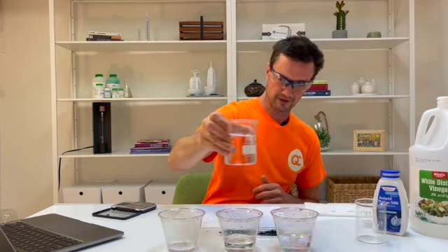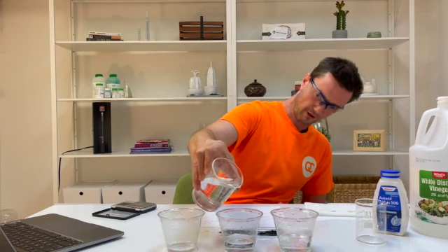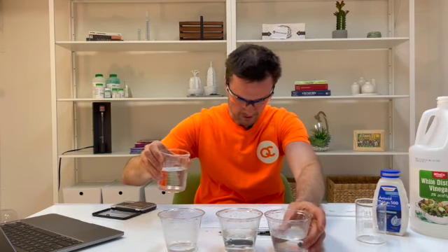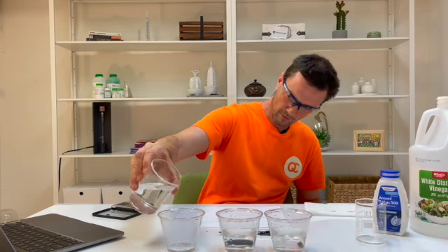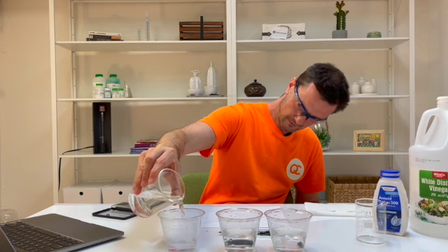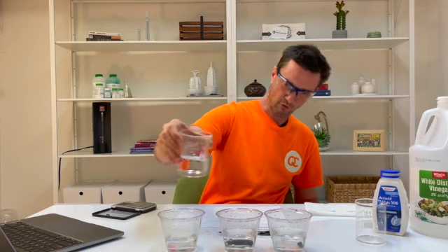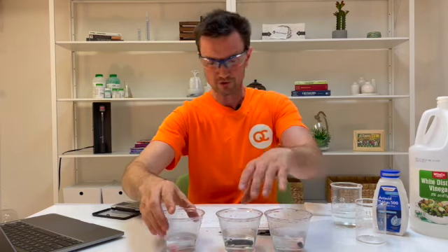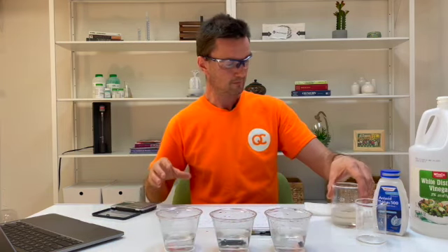Let's do 1 part vinegar, 1 part water. So I'm going to try to get the volumes to be the same. And this is 1 part vinegar, 2 parts water. Okay, so most concentrated, medium concentrated, least concentrated solution.